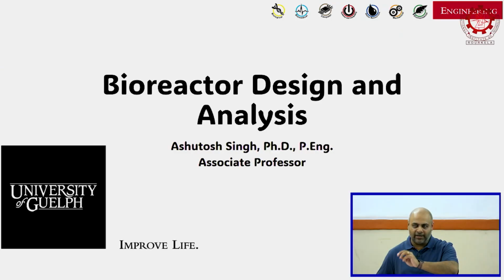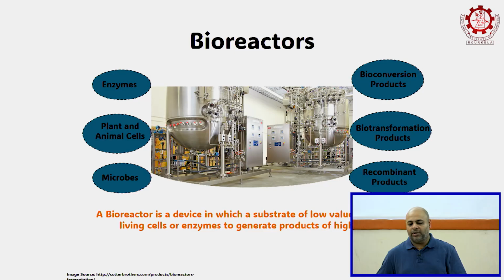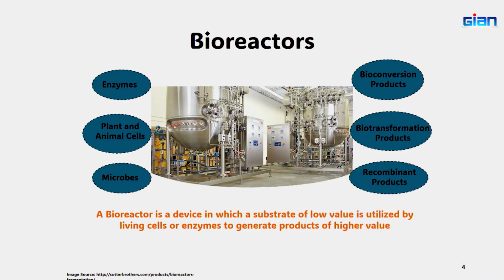Let's start the lecture for today. So we are going to start our conversation with bioreactor design and analysis. But before we get into the design and analysis part, we will talk a bit more about the bioreactors. We have covered the majority of the bioreactors, how they are implemented or how they are used with respect to your cellular agriculture and precision fermentation. But we'll go through it again.